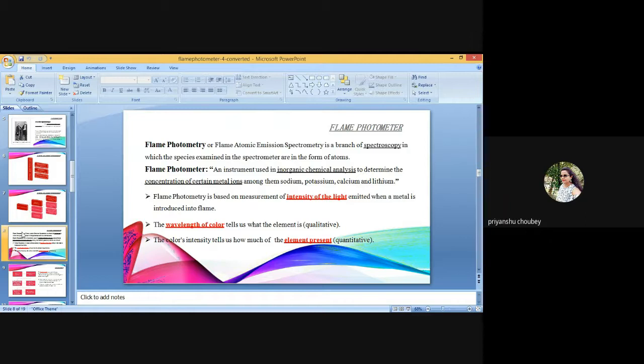Except one, connect the aspiration ends of all the pump tubes to a bottle containing degassed water.